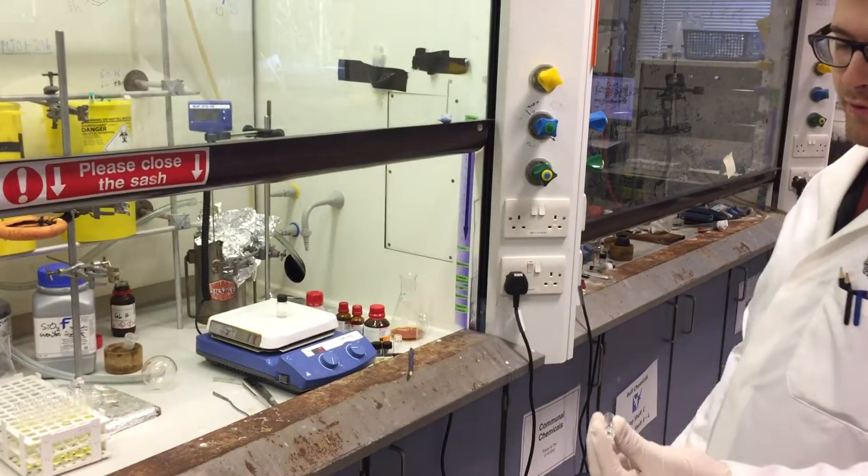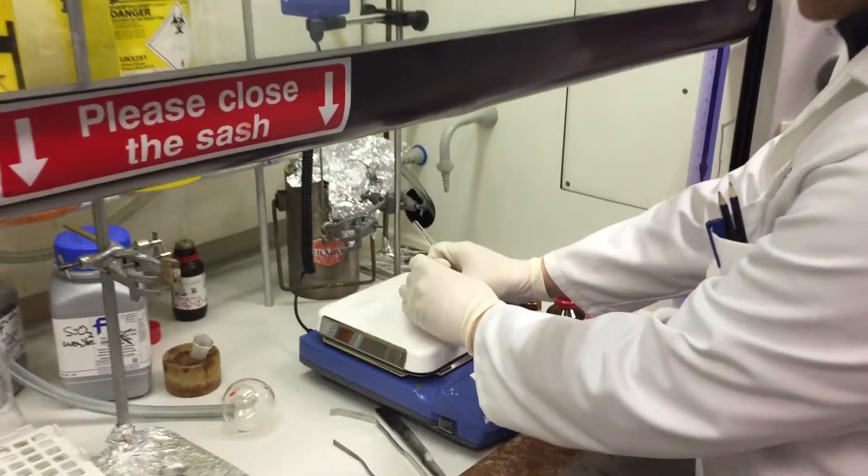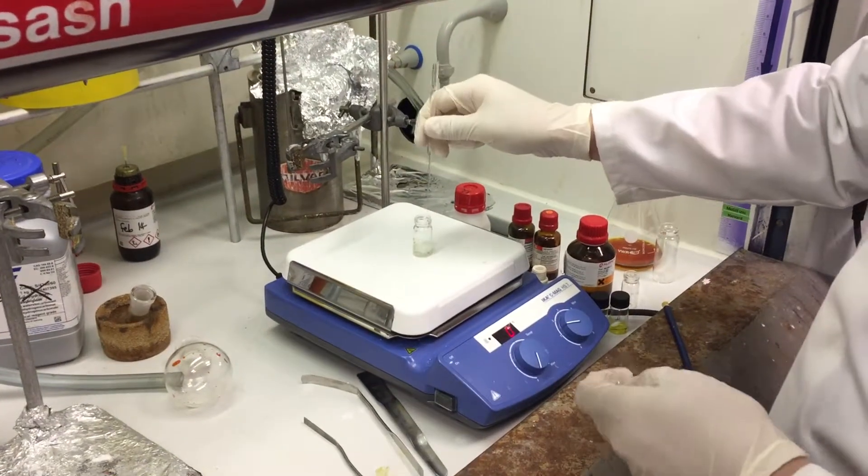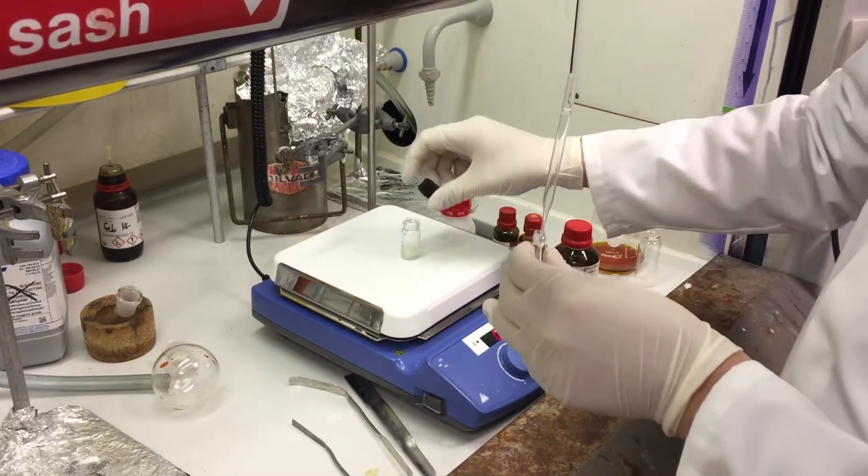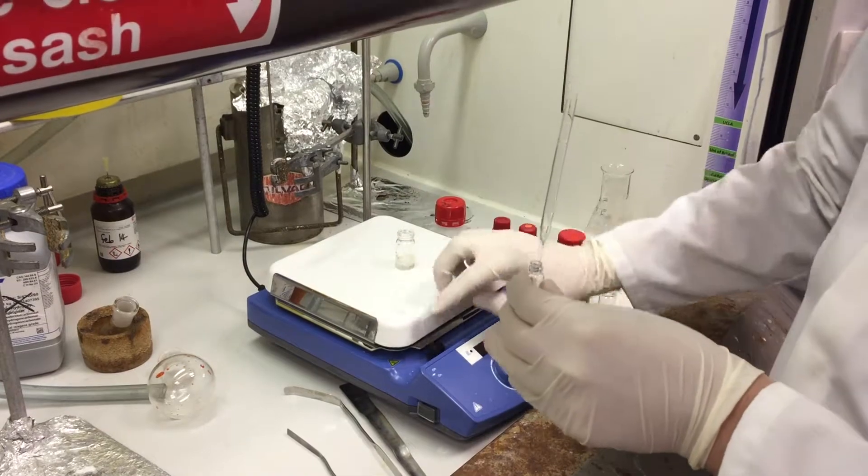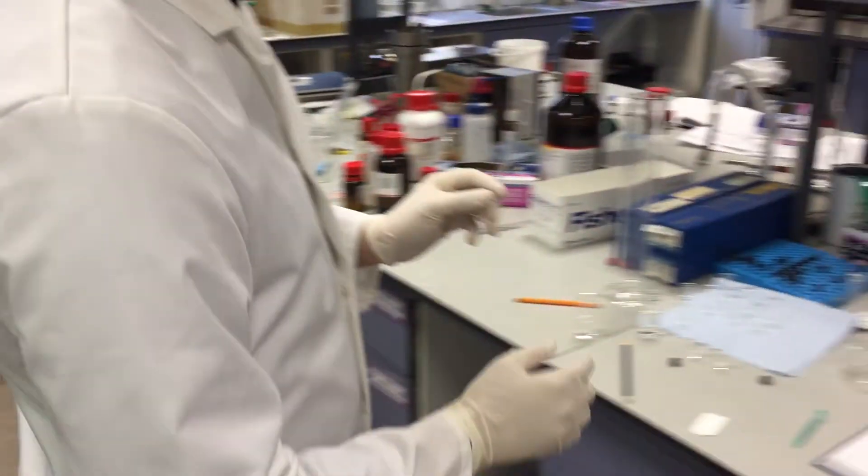So first thing you want to do is have a sample vial and a pipette. We'll collect a small aliquot of your reaction mixture. Just dip the pipette into the reaction, put it into your sample vial.